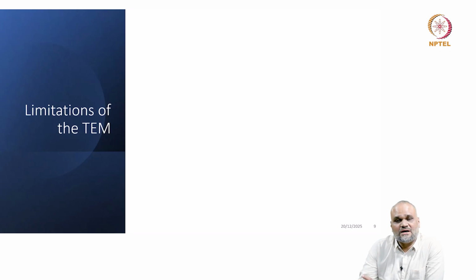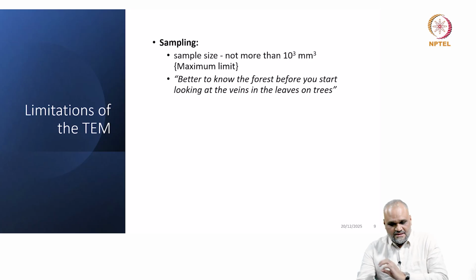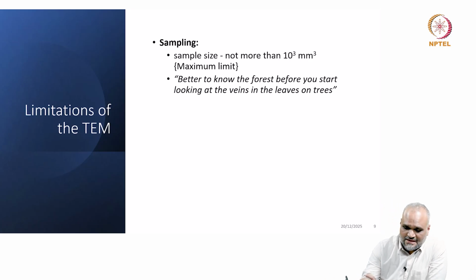I'll talk about what the limitations of the transmission electron microscope are. As I was just mentioning to you, here is a quote I've taken from a famous textbook. All of us who are studying microscopy usually start by reading this book from Williams and Carter on transmission electron microscopy. I kind of like this, so I put it here: it is better to know the forest before you start looking at the veins in the leaves on trees.